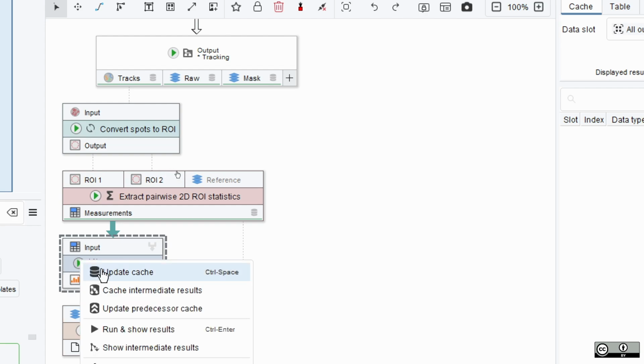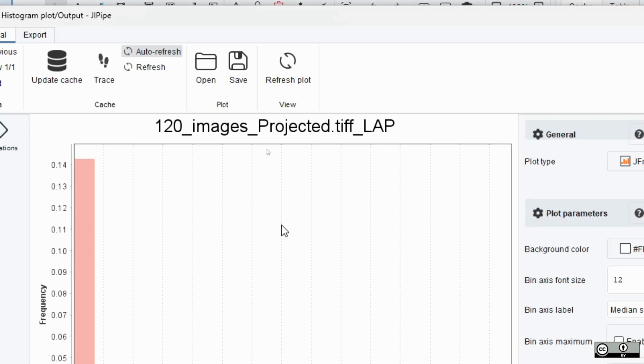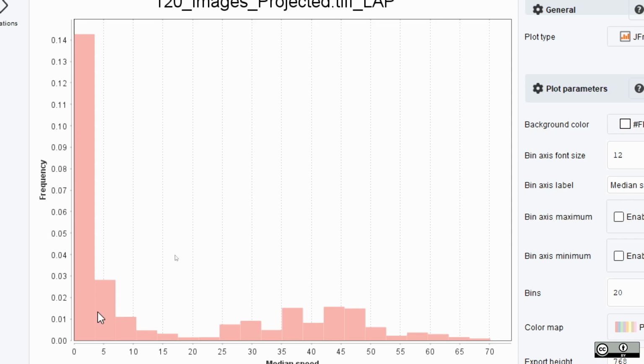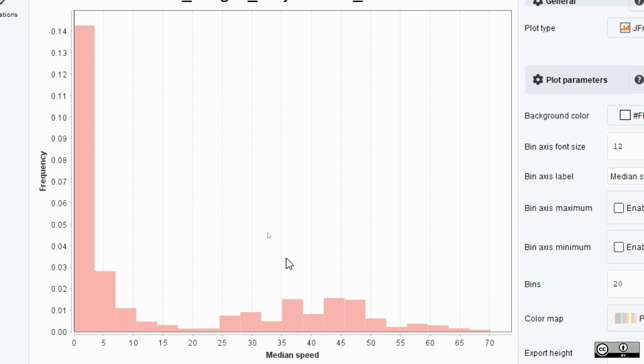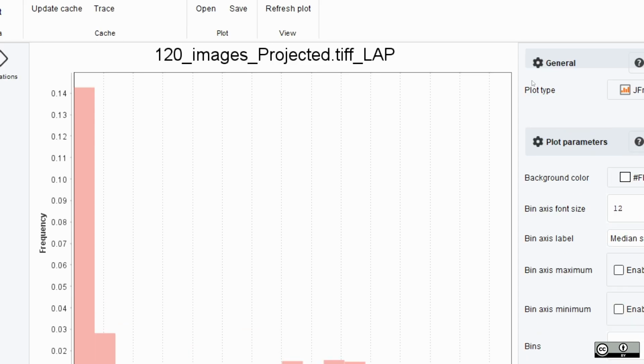It's a histogram plot. There is nothing new in it for you anymore. But what you will then see here is the output. And what you see is that, of course, this 0 bar is the ones measuring to itself. So that's natural. But what you will see is that the population in general is between 25 and I would say 55 pixels from each other. And then you can have this either per image or you can have it for the entire video.